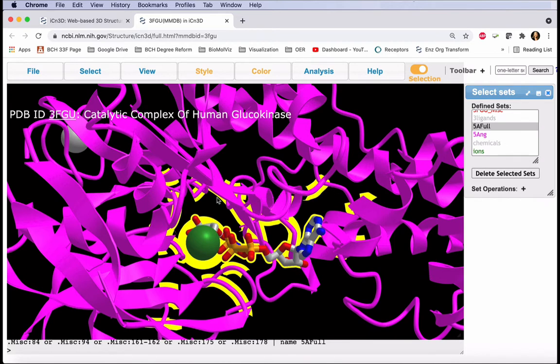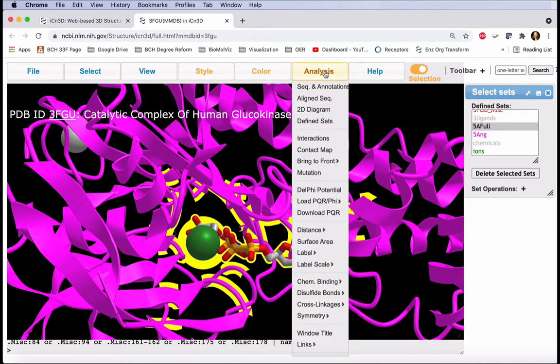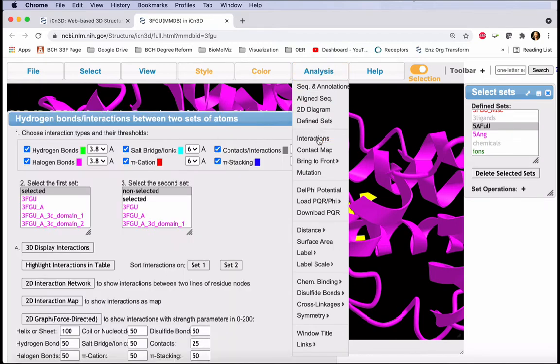I haven't yet displayed the sidechains as sticks. That's going to happen automatically when we show interactions, and I'll show you how to do it manually in a moment. In the Analysis menu, select Interactions.